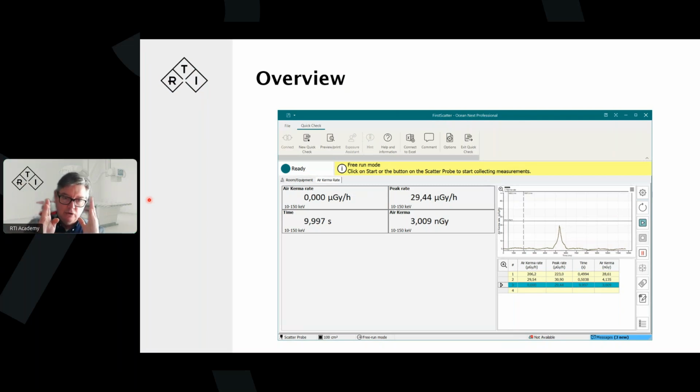So if you're comparing, you need to understand what you're comparing it to. If you have an instrument that cannot detect it, it does not mean that it is not there. It just means that you cannot measure it. With the scatter probe being a quick instrument, you can actually detect it, and then you've got a new world that opens up to you, seeing what is actually going on. That's where you need to understand what's happening there. So I hope that was answered, Yogesh Kumar.